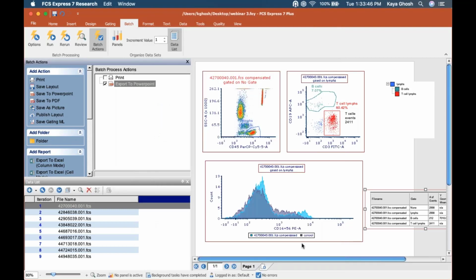I'm going to cancel that because just in the interest of time, we're just going to do a PowerPoint and an Excel only. PowerPoint is nice because you get these images that are spilling off of the side of the page, whereas PDF, it really does print the white page as you see it, so you would have these objects cut off, unless you, of course, move them over to be within the borders of the page.